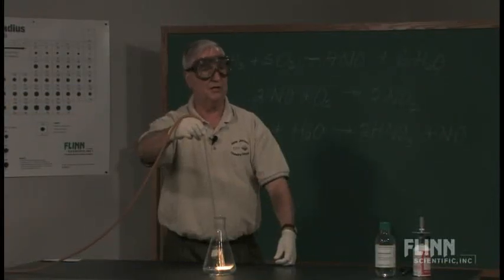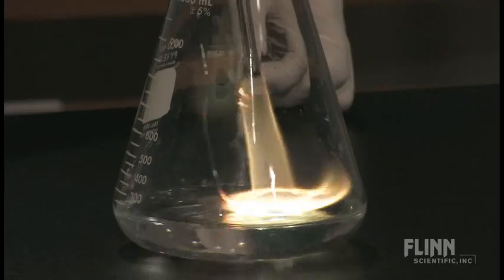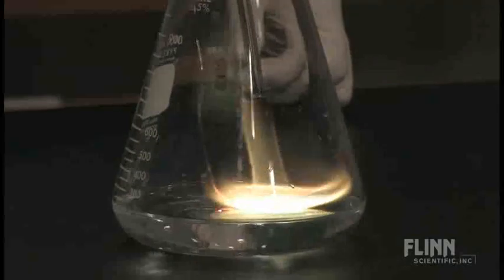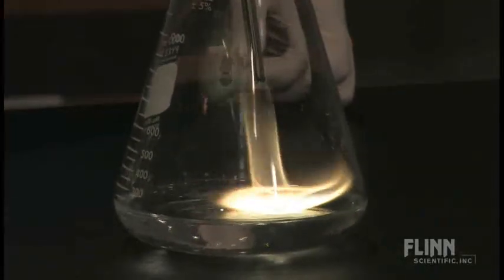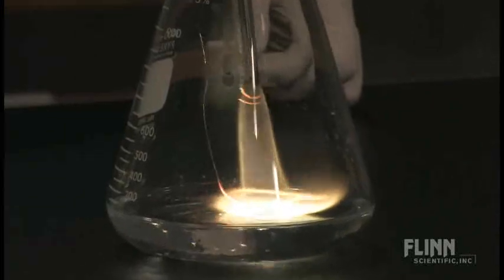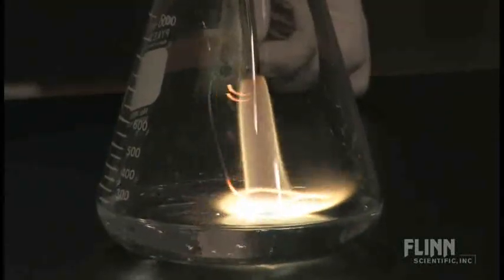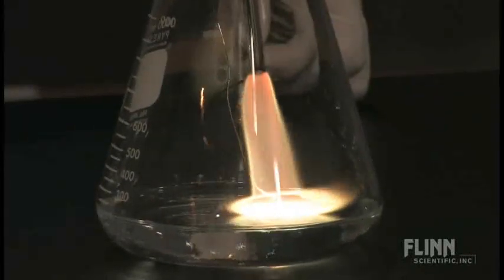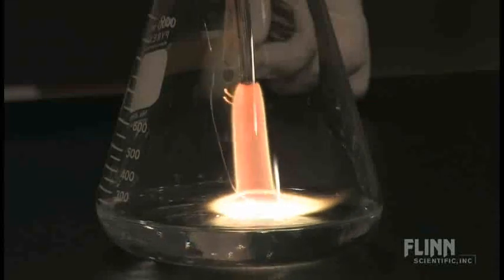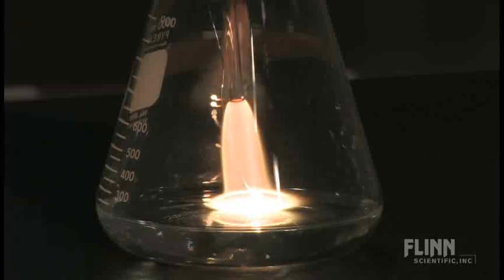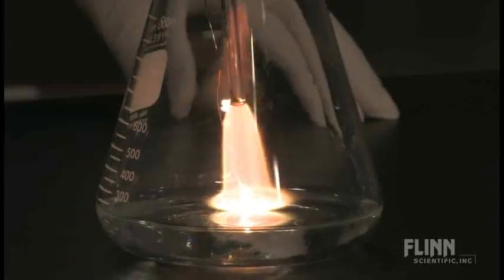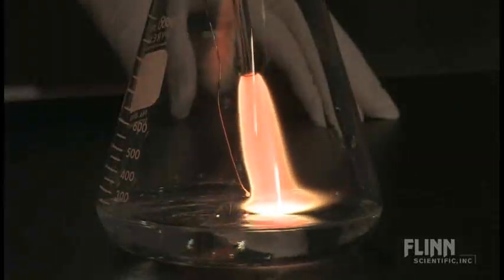Now you'll notice here a very interesting phenomenon, and that is the fact that we have produced the flame. This is sometimes referred to as an inverted flame. The oxygen is actually burning on the surface, so that the ammonia combustion is taking place on the surface of the oxygen gas, and this is referred to as an inverted flame.